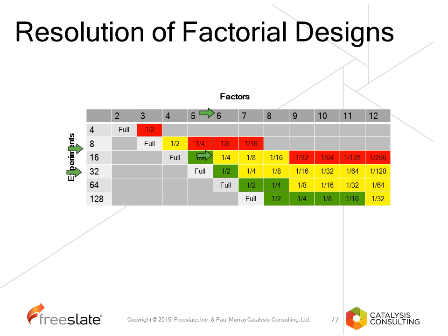It is possible to use a quarter factorial, so 16 experiments. And we can run those 16 experiments and we will get most of the data. That is a resolution 4 design. So we have a choice of different types of designs and different numbers of experiments that we can carry out. In my experience, I regularly use resolution 4 designs. I can understand clearly which factors are important, but I also know if the interactions are important.